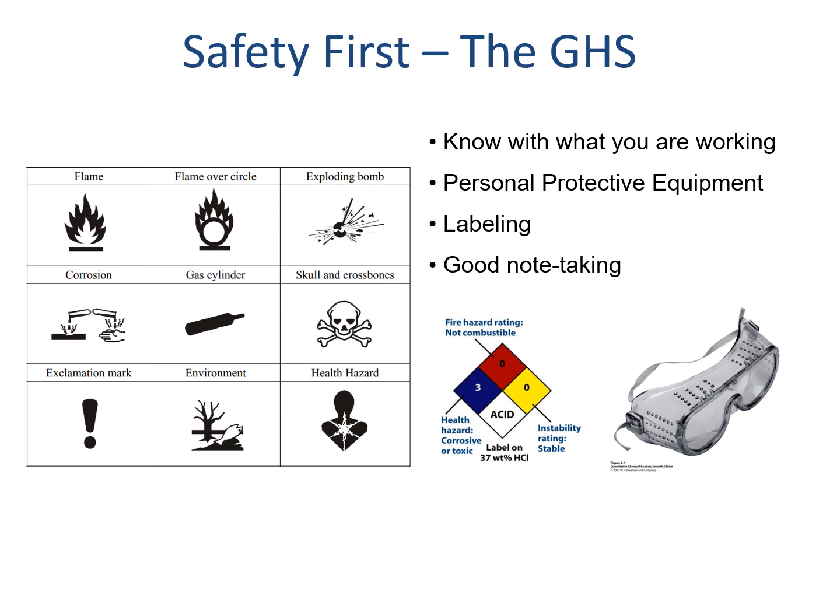These labels may sound scary, but the risks are most significant if they're not controlled. We can use flammable substances in fume hoods and keep our hair tied back near flames. We can store oxidizers properly, use gloves when using corrosives, and keep all food and drink out of lab, and always wash our hands before we leave to dramatically reduce risk.